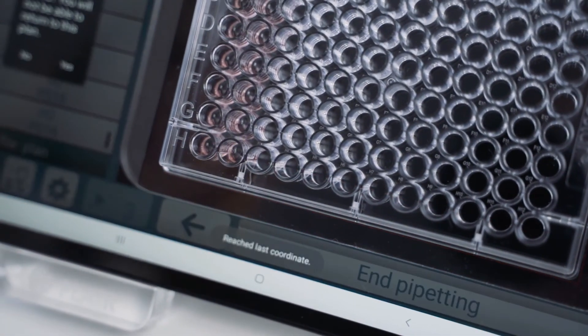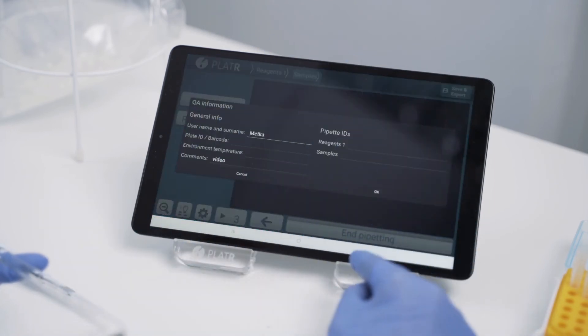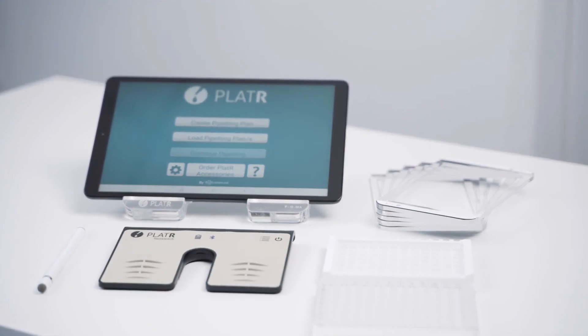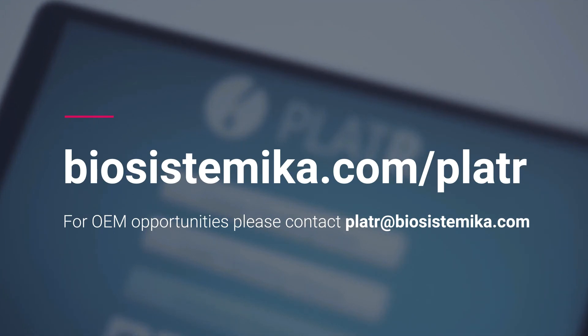PlatR tracks your pipetting, saves your pipetting report and QA information automatically. To speed up your onboarding, we can preset your PlatR protocols. If you want to know more about PlatR or order one for your lab, visit our webpage biosistemika.com/platr.